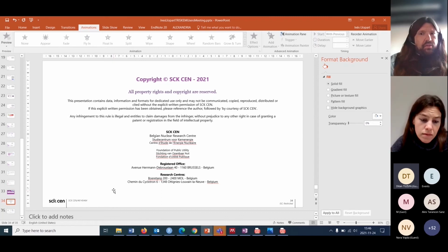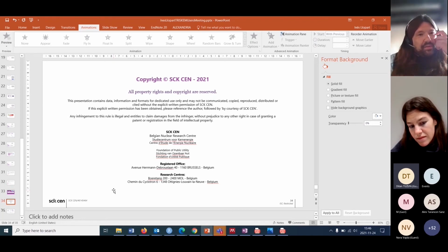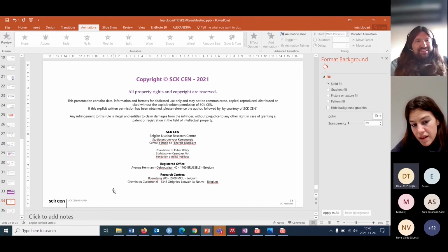Yeah, and I think you've shown the requested detection limit for the iodine. That's seriously low. To get to 10 mBq/g is going to be quite tricky. What are you going to try? Can you increase the sample mass, or do you have to go for mass spectrometry, or what do you think you will tackle next?